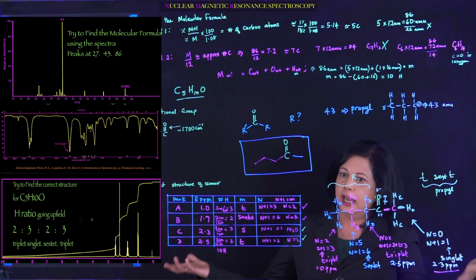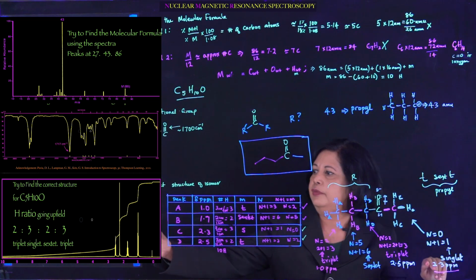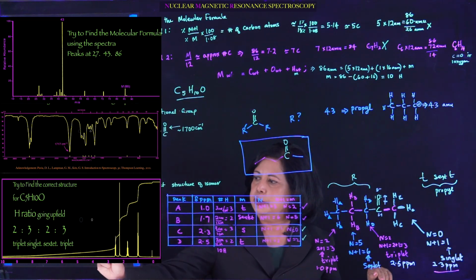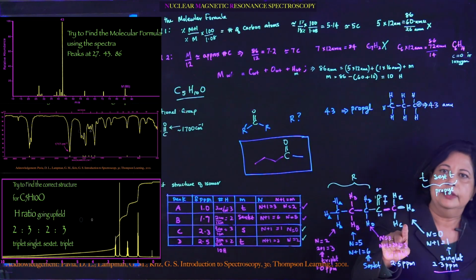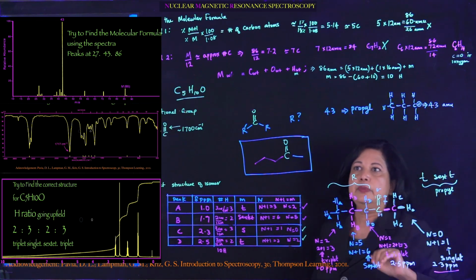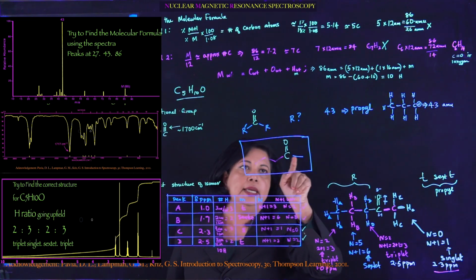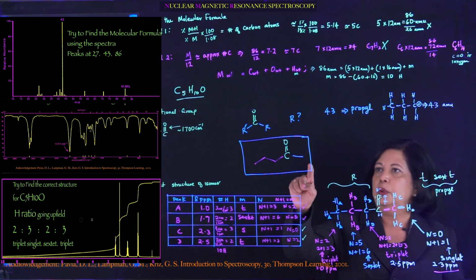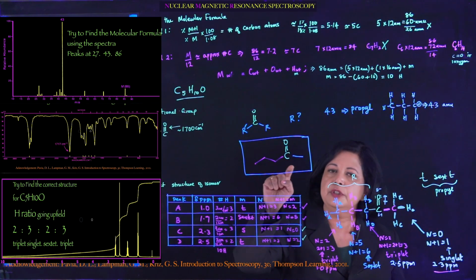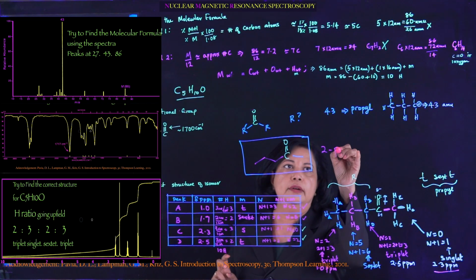What else could you have? If you put all of these together, you're left with 15, and 15 would correspond to the singlet peak here with 3 hydrogens, and that would be a methyl. So we'll have a methyl and we'll have a propyl on either side of this carbonyl. So that is going to be 1, 2, 3, 4, 5, 2 pentanone. That's your structure for the day, 2 pentanone, guys.